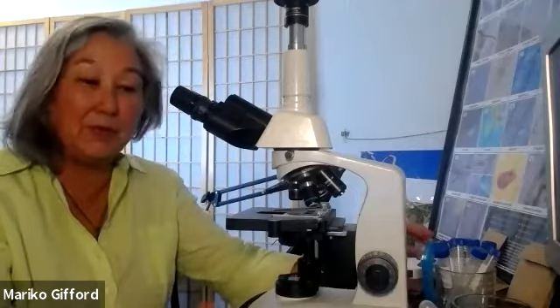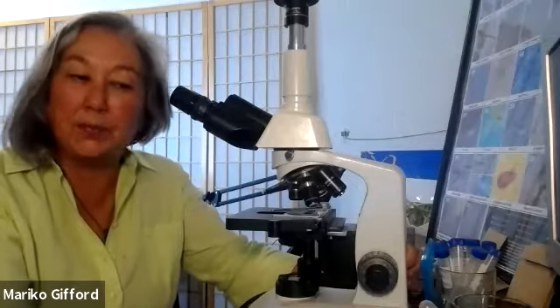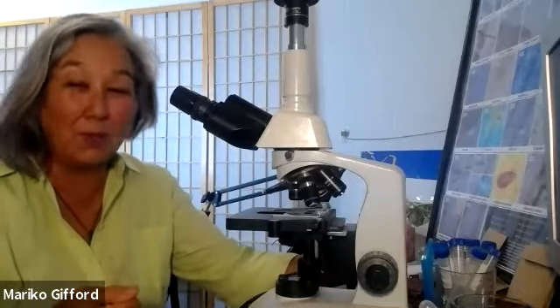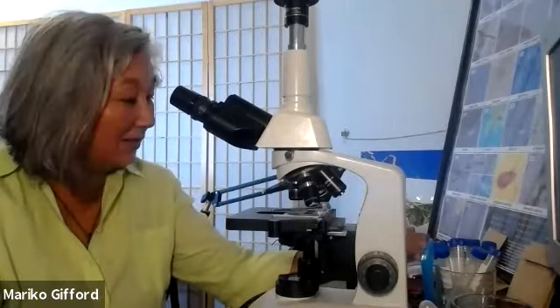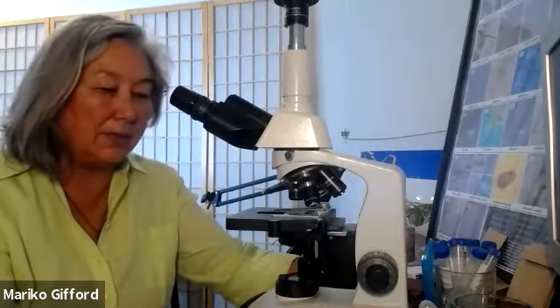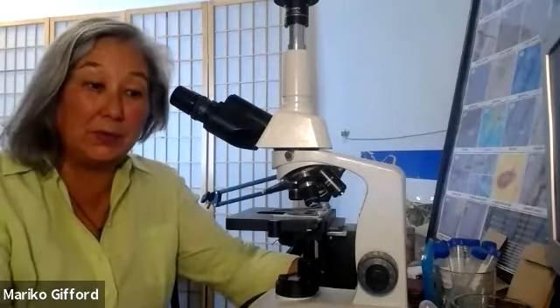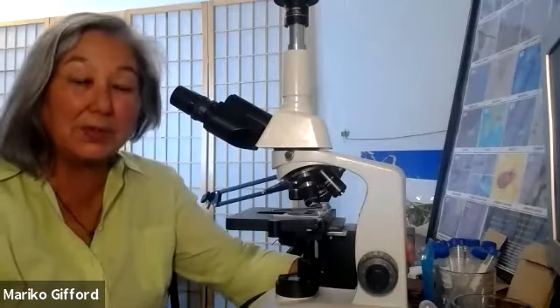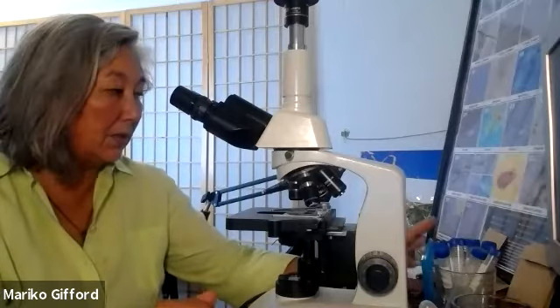And if you get your own, without being the Bionutrient Association, they are pretty inexpensive. Theirs is more expensive because you get the vice grip, which, when you start trying to take water out of a moringa leaf, you're going to want. You can make it yourself too, if you're handy and you can weld, but getting that drop out of there is challenging. But you can use it for all other foods that you are producing. So not just with moringa, but if you're doing a co-crop, intercropping, or you want to know how your fruit trees are doing and the quality of the sugars in the fruit, it's a really good baseline piece of information. So these are tools that I wanted to show.